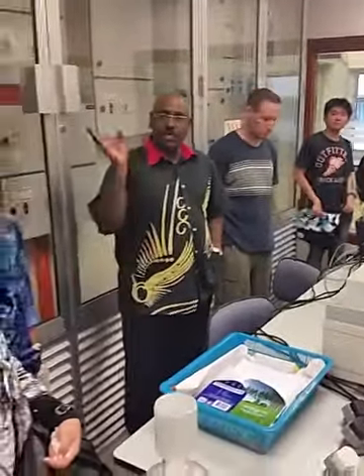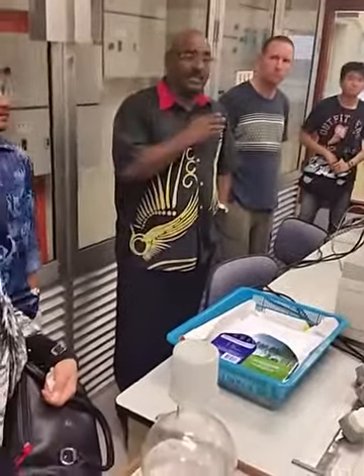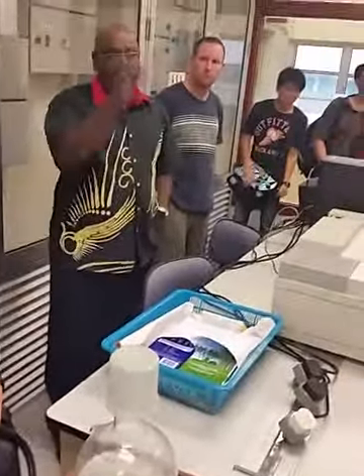You can go up to 32 elements per scan. This is simultaneous detection of all the elements.